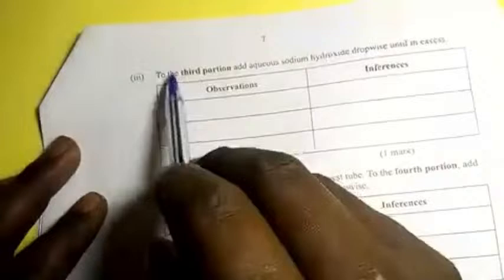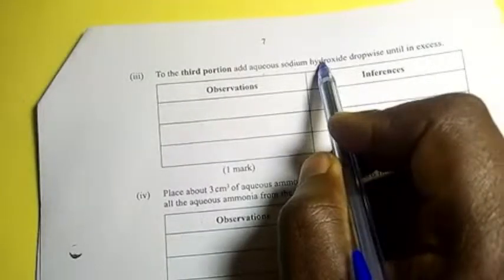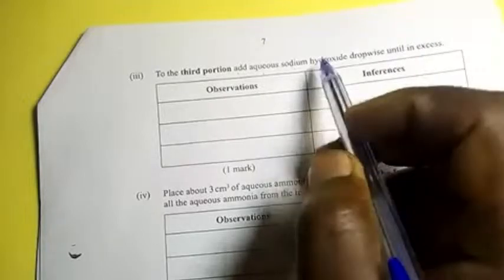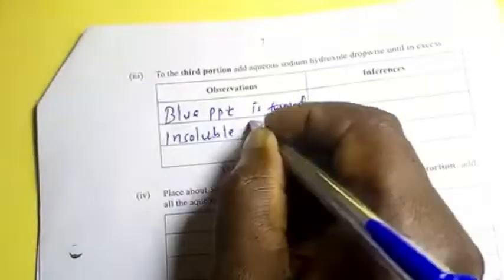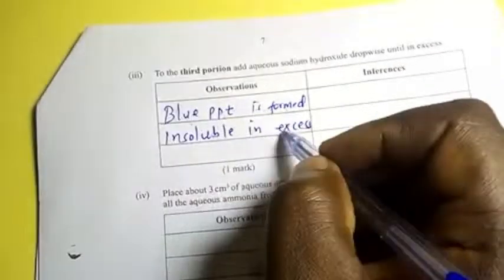To the third portion, add aqueous sodium hydroxide dropwise until in excess. We are adding sodium hydroxide until in excess. The blue precipitate is formed, which does not dissolve, or is insoluble in excess. So a blue precipitate is formed which does not dissolve in excess sodium hydroxide.